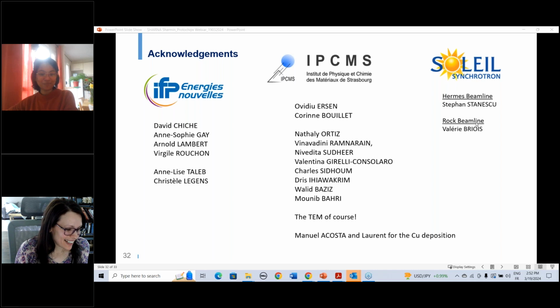Yeah. Oh, I got a clarification on the question. I may have morphed it incorrectly. They clarified to maybe just, would you use mass spectrometry to maybe see the water content at the start, as the water content may have an effect on what you're doing? Yes, we did have a look, but the content of water would be more related to, for example, if we are doing reduction, the amount of reduction. But no, I don't know how it can influence the observation that we had.